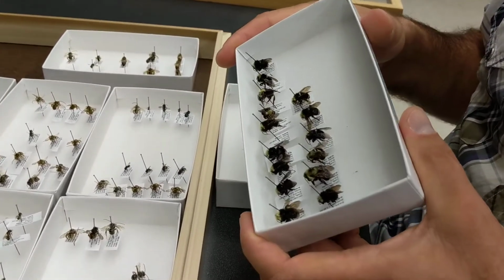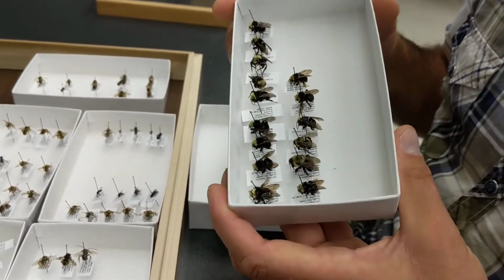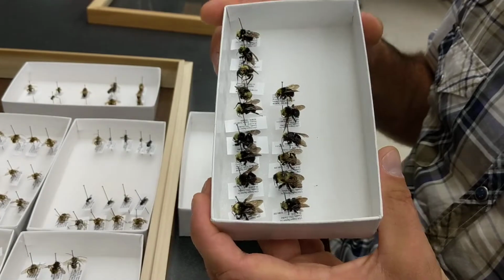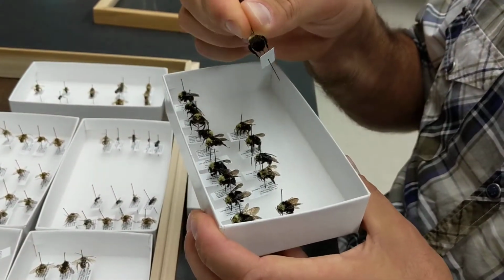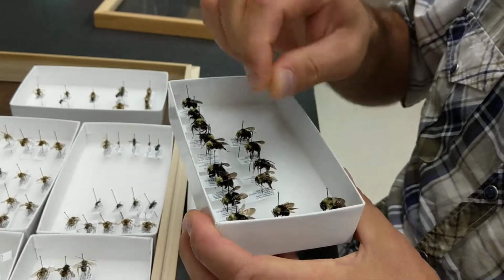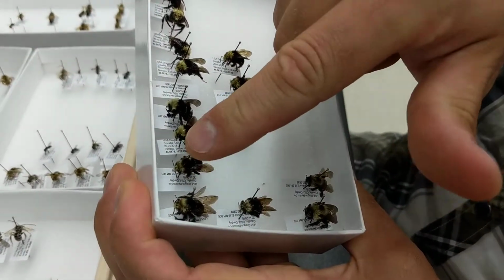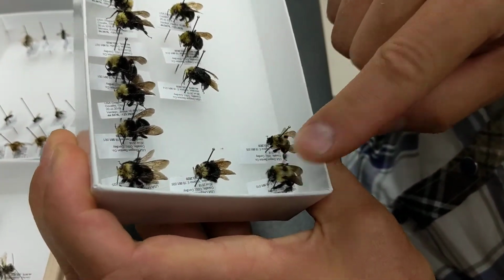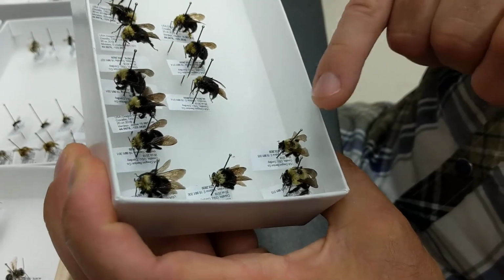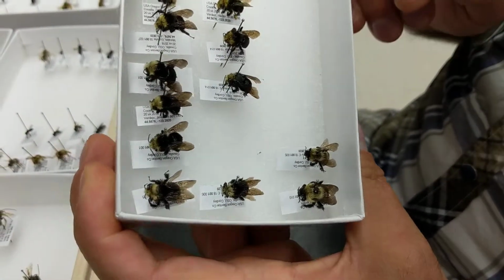That's right. So just looking at these bumblebees, we can see that most of them are yellow-faced bumblebees, but we have two that are not. You can see these ones all have a yellow face and yellow shoulders, but these two specimens have a black face and much more extensive yellow on the thorax.